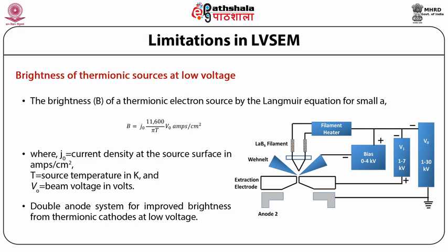The LaB6 cathodes have a comparatively more pointed tip that reduces the space charge effect and are about 6 to 10 times brighter than the tungsten source for comparable lifetime. They also operate at a lower temperature than normal tungsten, T equal to 1500 K to 2500 K.